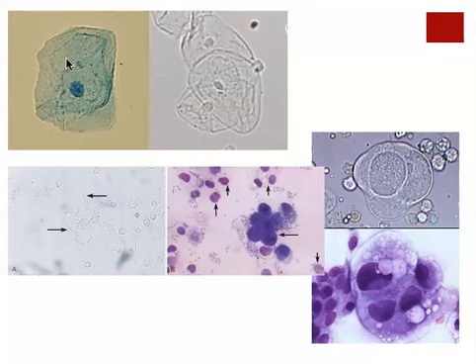Different stains are intended to adhere to different types of molecules with more or less affinity. So this stain adheres particularly well to the DNA that's sitting in this nucleus, and that's why the nucleus is staining so darkly. Over here, we can still see details. We can still tell that these are individual cells, and you can count the cells because each cell has a nucleus in it. But it's just more difficult to see anything with any clarity when you don't stain a cell.